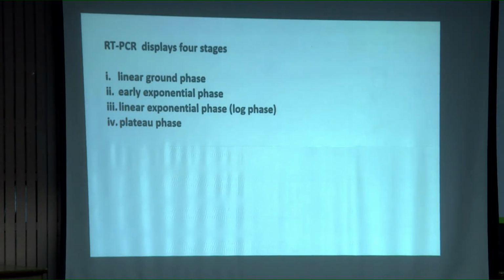Now let us come to the data. What you are going to see after doing all these things, right? In normal PCR, after this you are going to see a bright amplicon of expected size. You get excited, right? Three scenarios. Amplicon is not at all there.